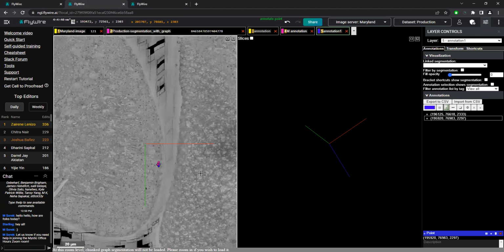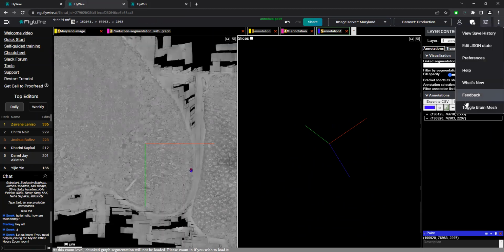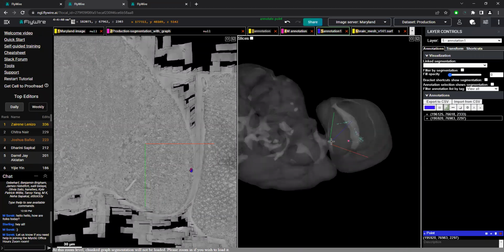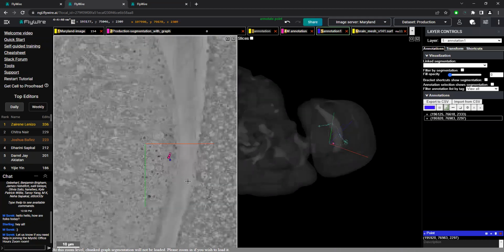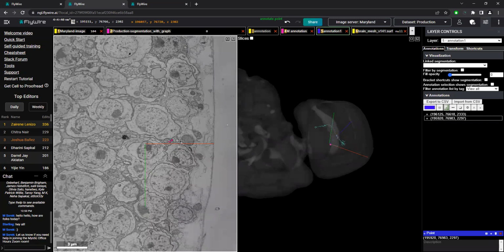what's happening is it's going from the, I believe this is, let me bring up my 3D. Yeah, so it's going from the optic lobe into the central brain here. And so there's a bit of a jump between the two of them, like a chasm that goes between them. And so that's why we have this kind of issue around the edge.